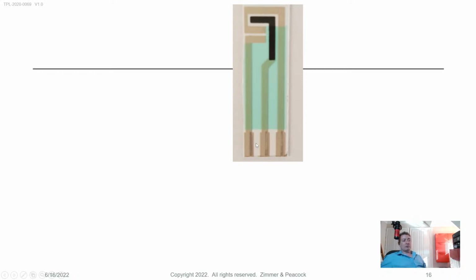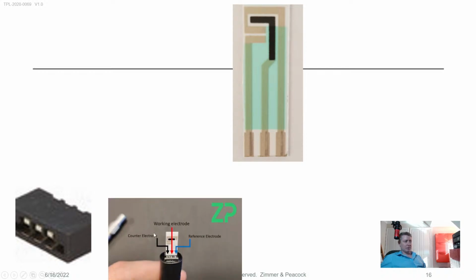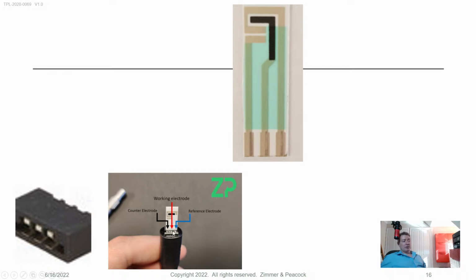At ZP, all of our electrodes have a pitch of 2.54 millimeters. This is becoming pretty standard. If you look at the electrodes from contact to contact, there's a pitch of 2.54 millimeters. When you're dealing with companies like Palm Sense and Zimmer & Peacock, we're all using the same connector. I'd even throw Drop Sense in there as well. So that means with some skill, you should be able to put ZP electrodes into, for example, a Palm Sense cable. You should be able to slot them in there.